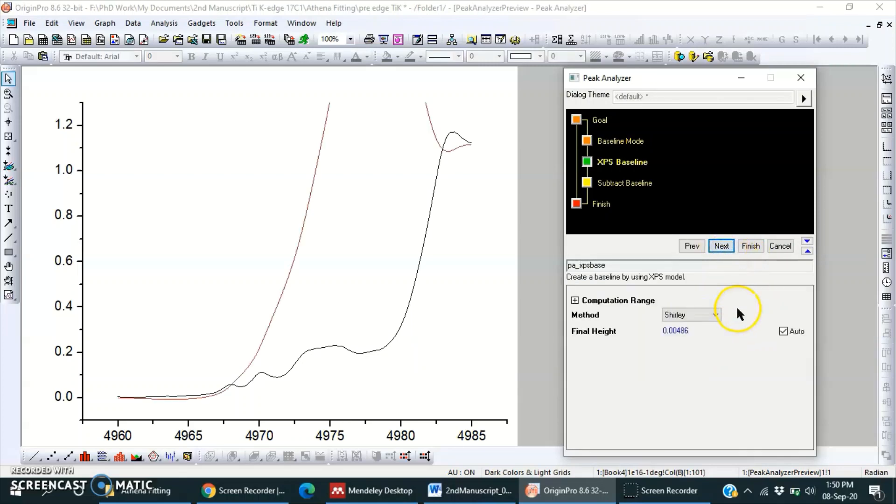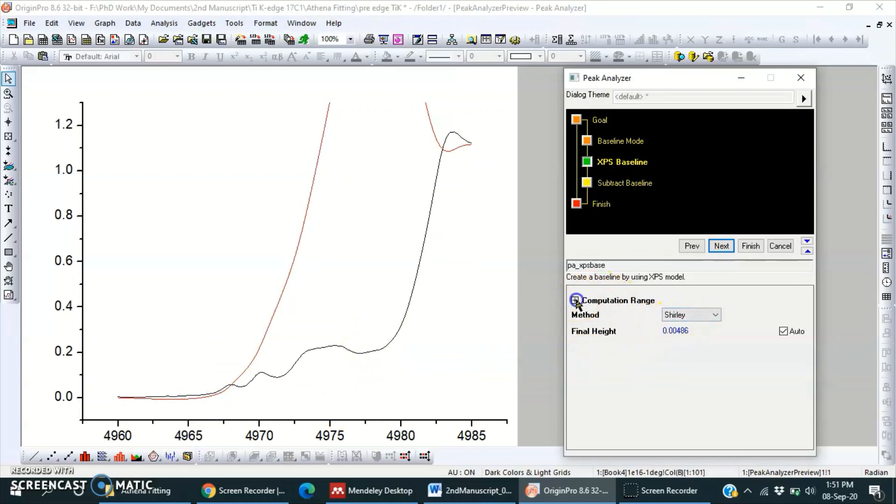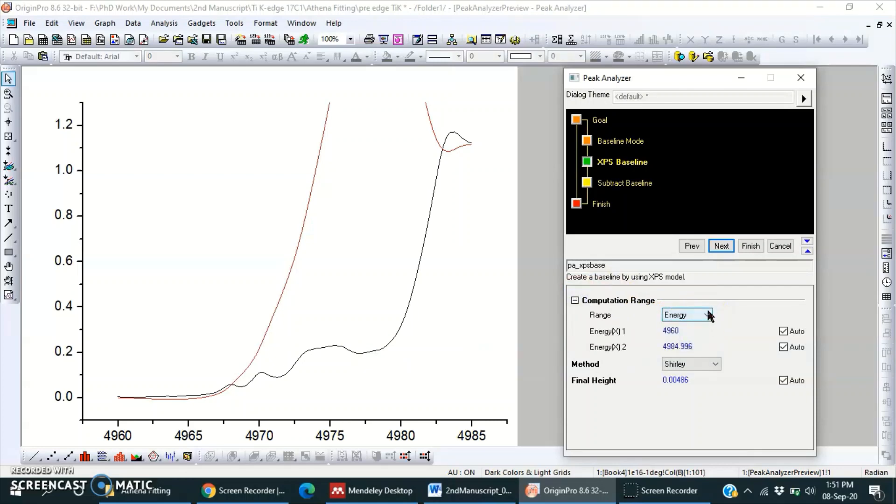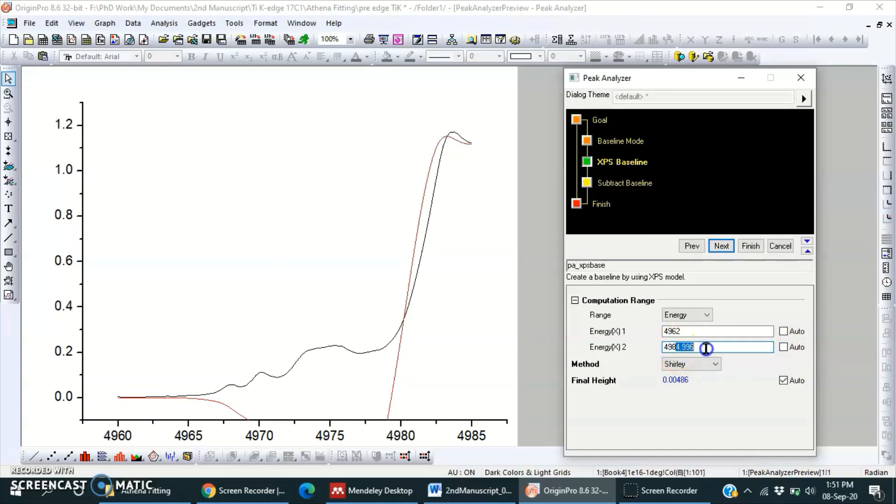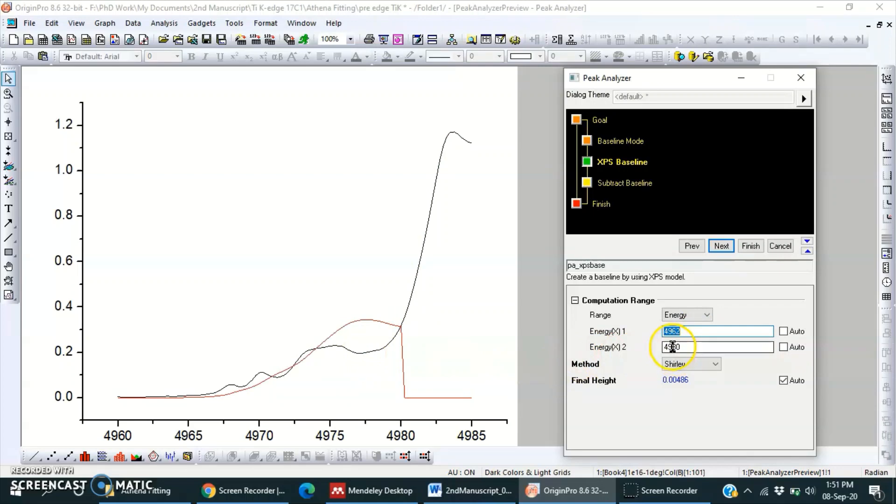And then next. Okay, this is a Shirley baseline for the whole spectra, but we need only from this to this point. So we have to change this setting. Here it is row, so change it to energy. And the range we can also change here. I have done 62, and then here I think it will be good. No, it is here, so here is 77 or 78. So 78, try. Not good, so try with 77.